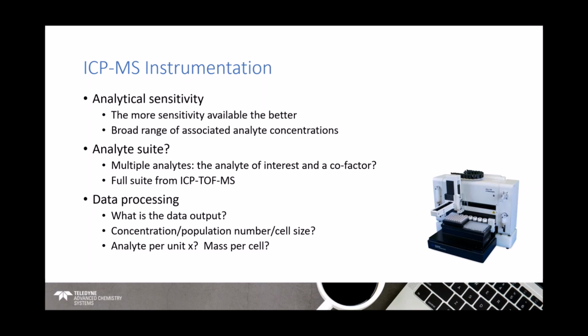The more accurate the data is going to be. The analyte suite, the analytes of interest, this is another area of a lot of discussion at the moment. So there's two approaches to this kind of work, and typically it's either being done by quadrupole-based ICP-MS, so either with a standard quadrupole ICP-MS or a triple quad ICP-MS, or by one of the new time-of-flight ICP-MS instruments. So you've got to then start questioning, what kind of data do I want to get from this?